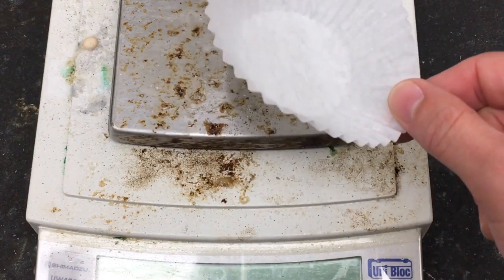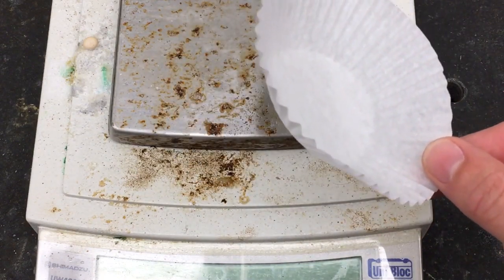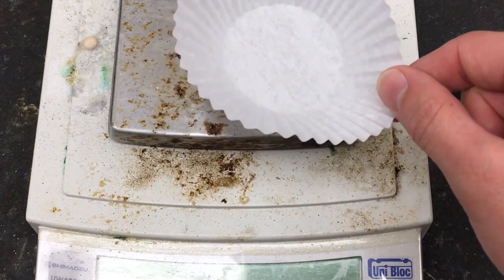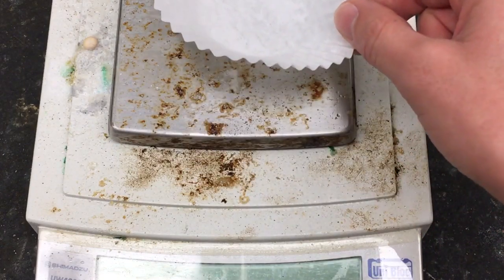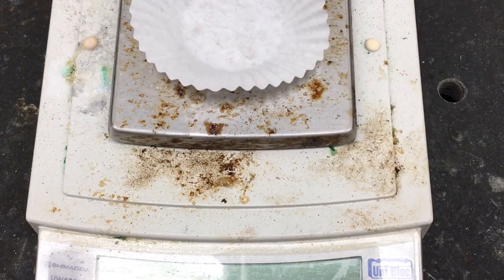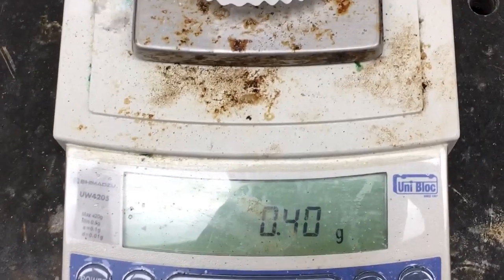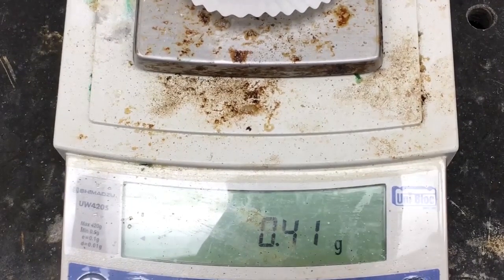You know, this simple weigh boat, you can use wax paper, little plastic weigh boats, whatever you have in the lab. So the first thing is we would put our weigh boat on the scale. Well, it has a mass, big surprise. Okay, these are the controls.